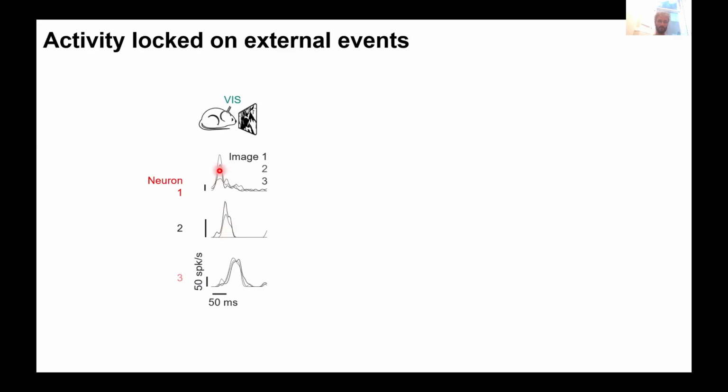And actually, it's coming a bit later than this neuron. Same for this neuron, which is actually coming last. And here it does not really encode which image is on the screen. Okay, so that was for 3 different images. You can also show many different images, like about 100. And you can see that these 3 neurons actually always spike at the same time, but encode the image, so on the y-axis is the image, but encode the image by their overall amplitude, especially for this neuron here.